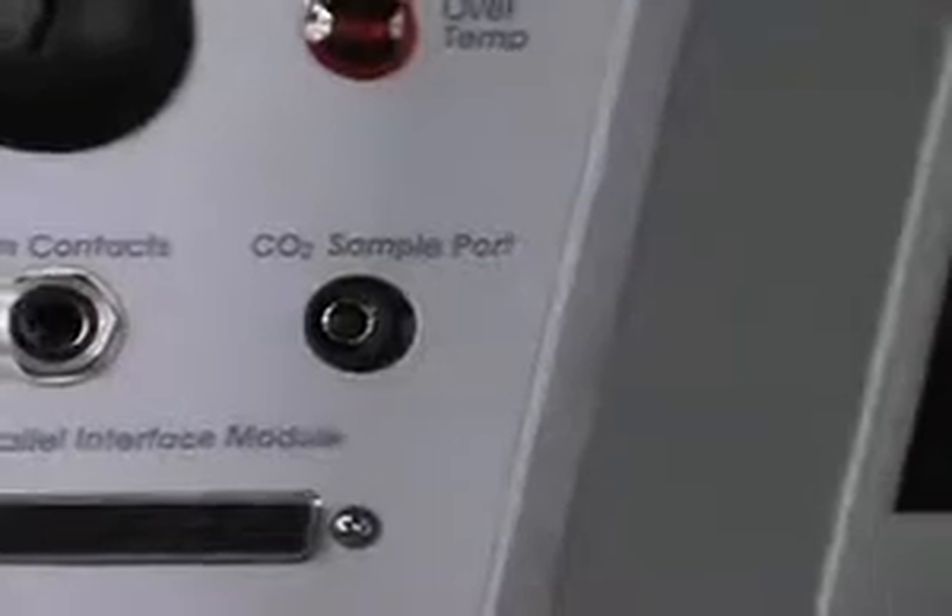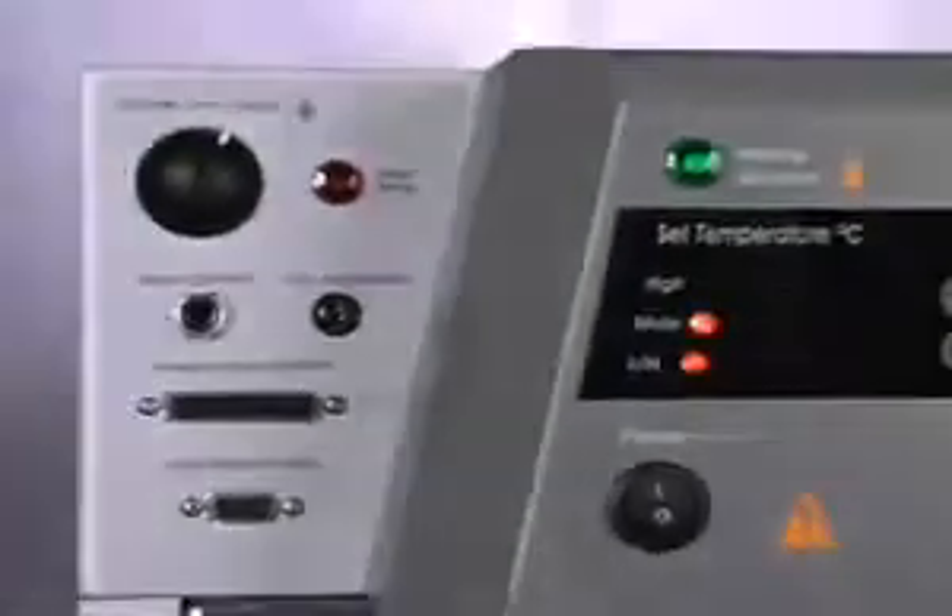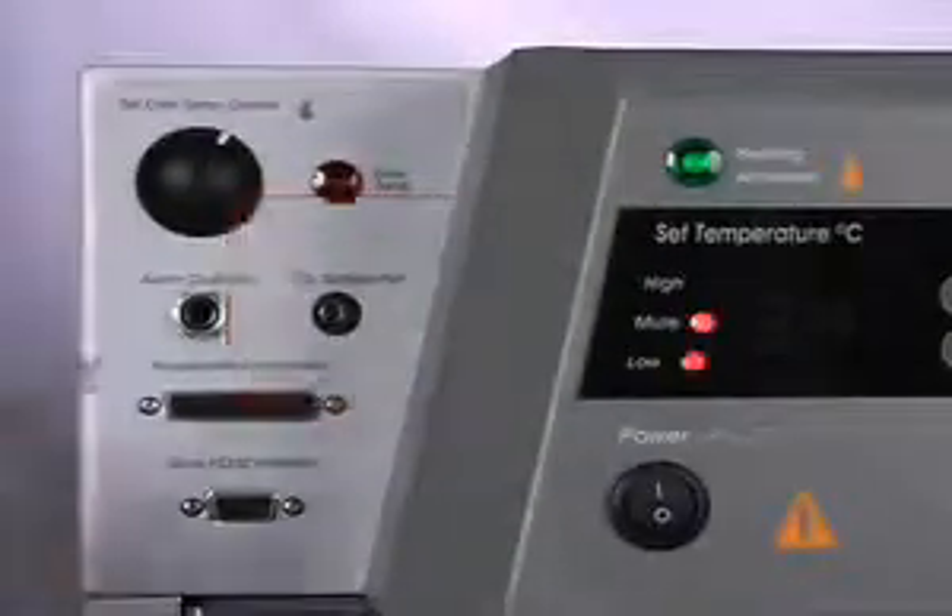These Sheldon incubators integrate such features as a front-access CO2 sampling port. This allows you to directly connect a carbon dioxide monitor or ferrite for validation and measurement.